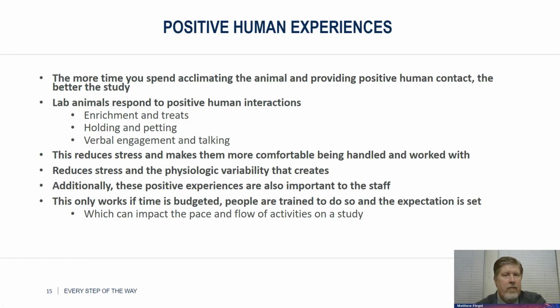But I will tell you from a lot of that experience, the more time you spend acclimating the animal and providing positive human contact, the better the study is going to go. The better acclimated the animals are, the more comfortable they are with us. So prioritizing. Let's go down there and work with the animals outside of the study. Let's give them enrichment. Let's give them food rewards. Let's give them toys that they don't commonly have exposure to.